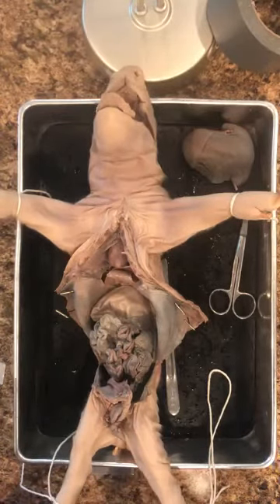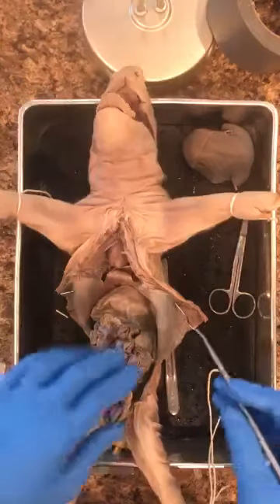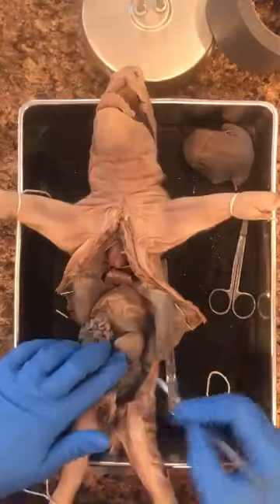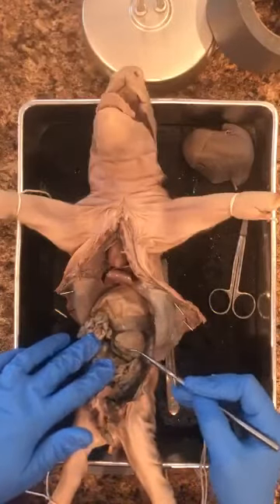The larger diameter portion of this on the left of this animal is the large intestine, and it's in this bound spiral shape. So right here is all stuck together. This is the large intestine.